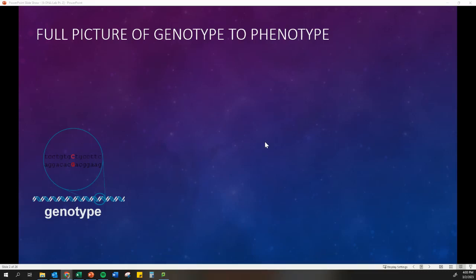Okay guys, so I'm going to go over the second part of the DNA lab. After PCR, if you had a question about PCR, I had a previous video on that. But again, this is a full picture of what we're looking at.